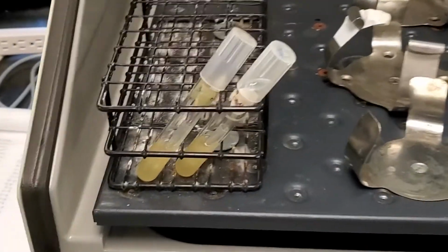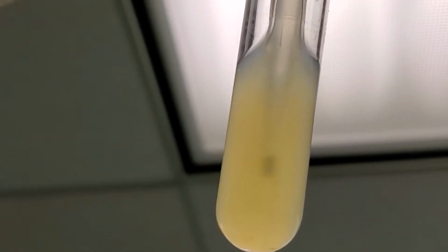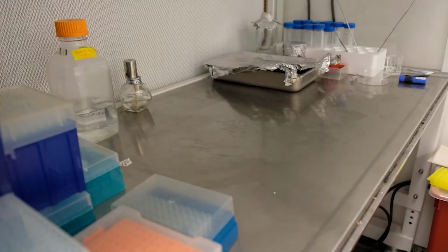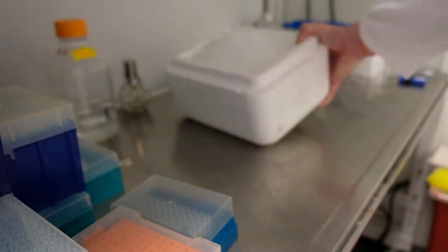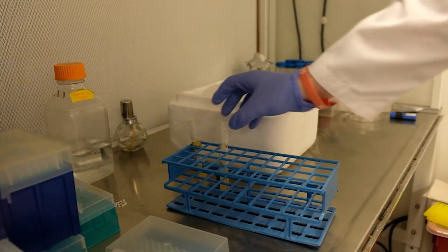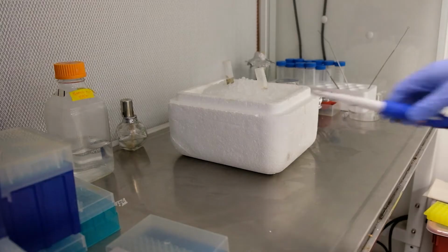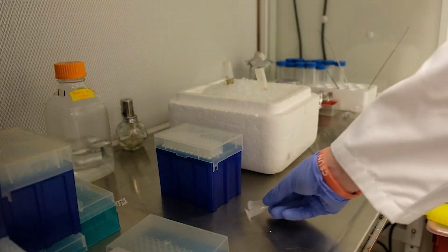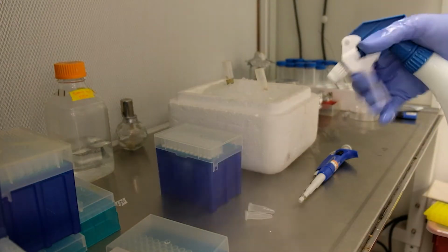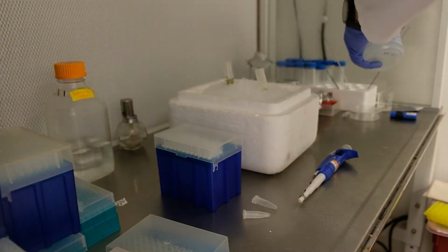Next day, the cultures should be visibly turbid. This means you're ready to start the next step. For this part, you're gonna need ice. Stick your cultures into it to keep them cold. Prepare your pipette and the corresponding tips, and 2 sterile microfuge tubes. Disinfect the area by generously spraying with 70% ethanol.